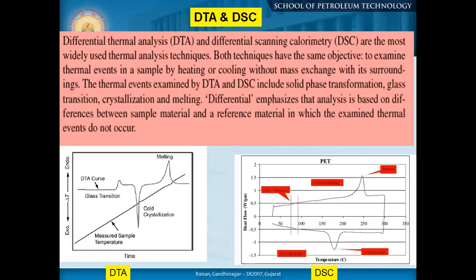But okay, so what is DTA and DSC? If you see, the two graphs are more or less similar, but the measurement parameters are different in both cases. Differential thermal analysis and differential scanning calorimetry are the most widely used thermal analysis techniques.